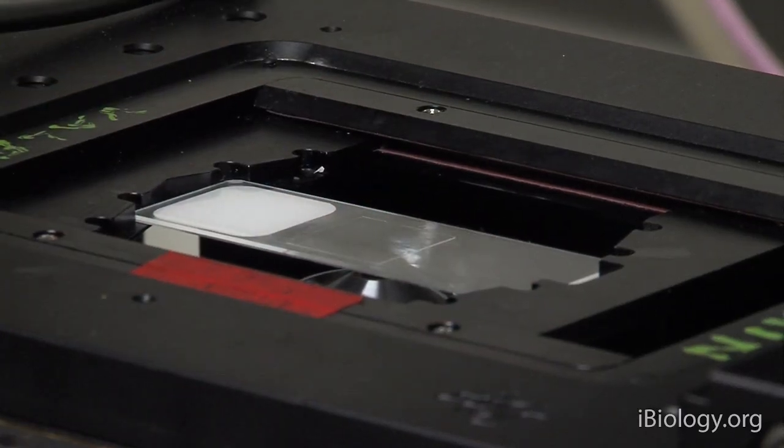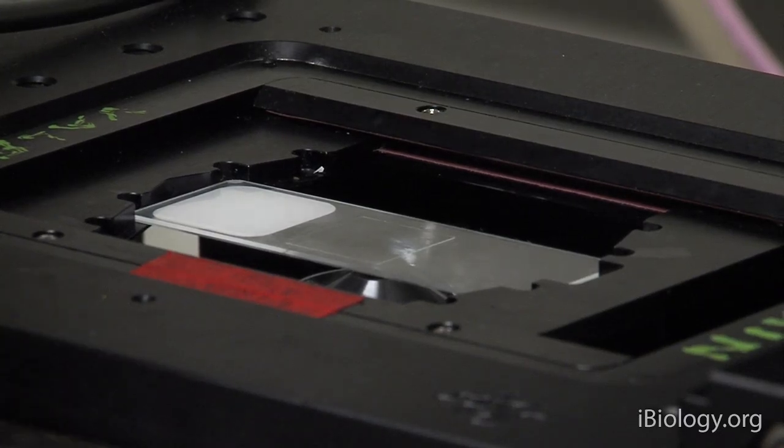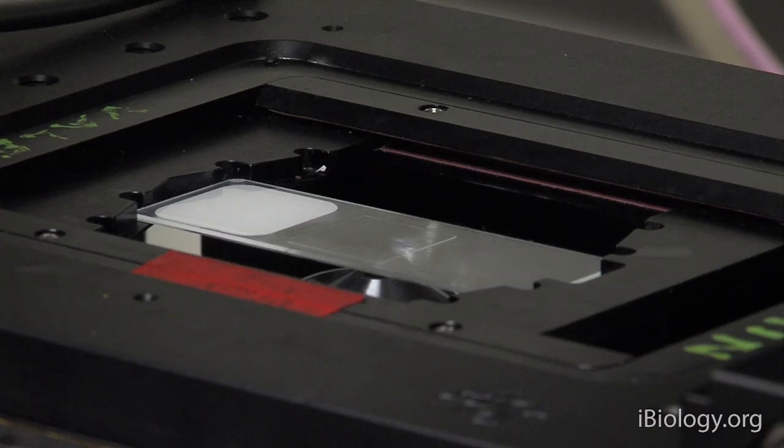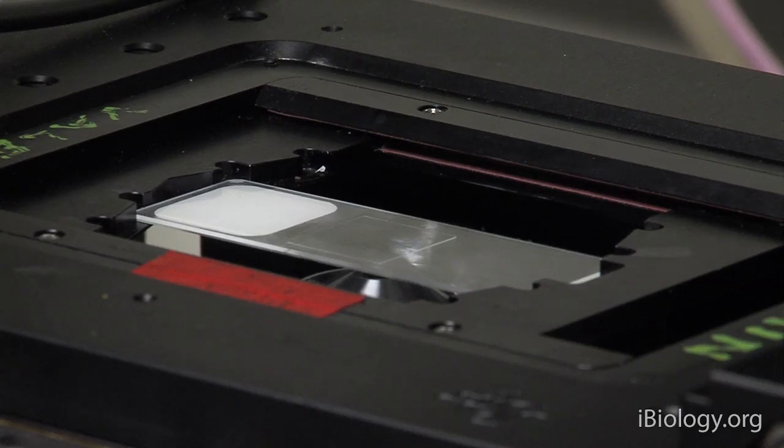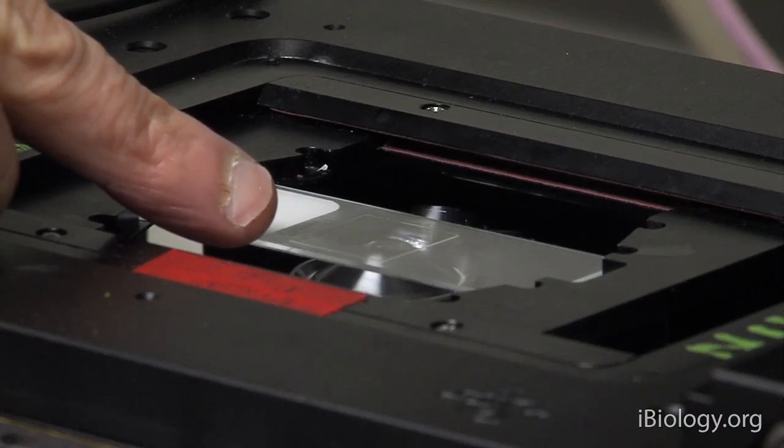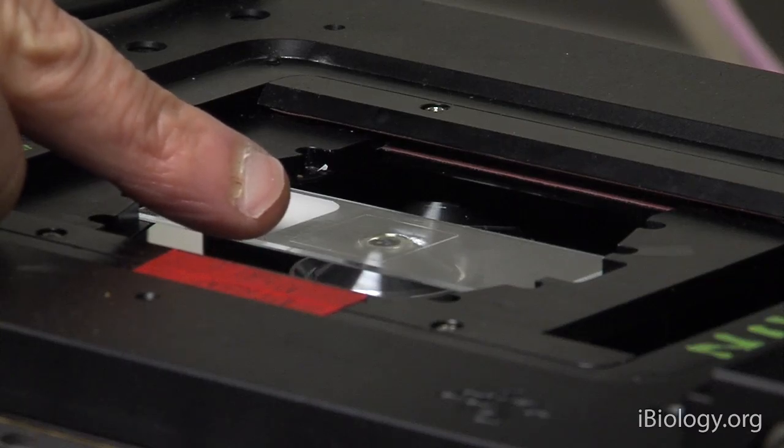Now, before I start focusing with the eyepiece, I want to get the objective lens to approximately the correct position, and I can do that with the coarse focusing knob. What I'm looking for is the moment when the oil comes in contact with the coverslip. At that moment, as I am now focusing up here, I'm watching for the moment when the contact is made and the oil spreads on the coverslip surface. There it goes, right there.